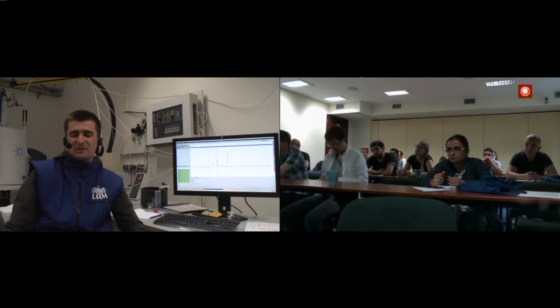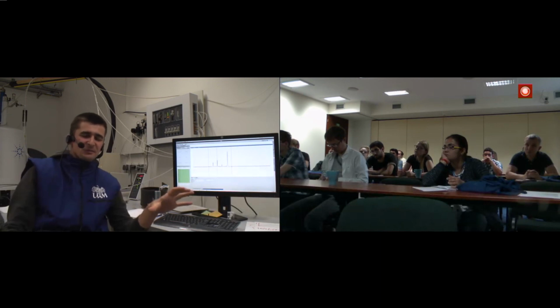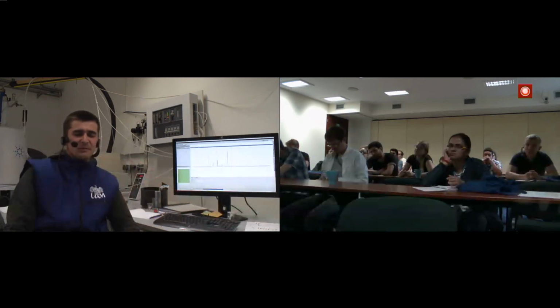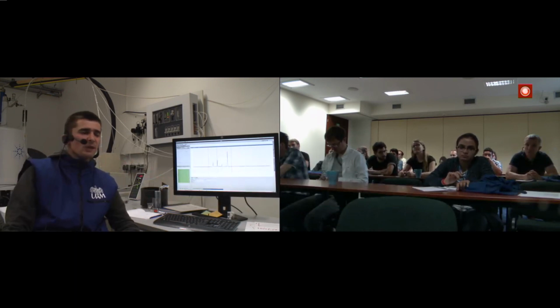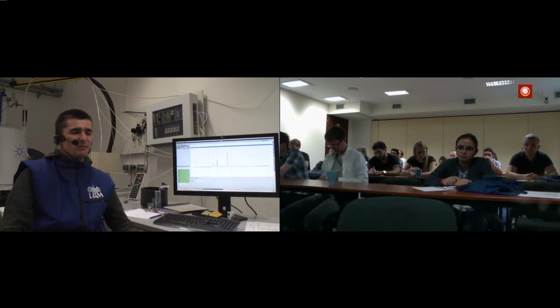It's slightly more complex. However, we can imagine performing those experiments, for example, waiting enough time to fully equilibrate our system. But those experiments could be very time-consuming because, Zbigniew, you're absolutely right, usually for carbon-13 the T1 relaxation is relatively long, so we would have to wait a significant time in order to have representative integration underneath our peaks.